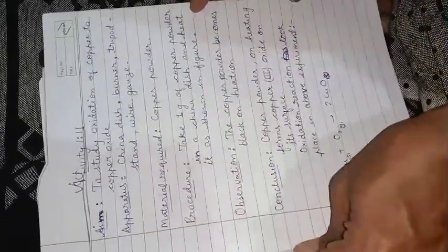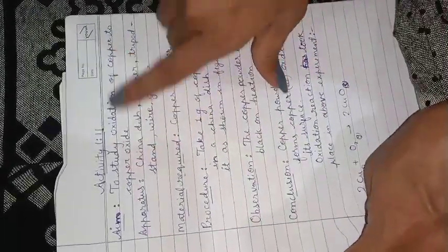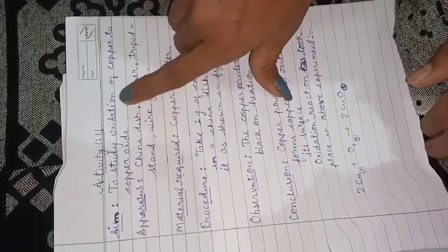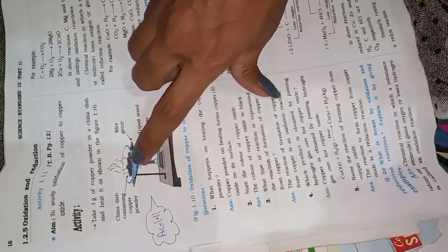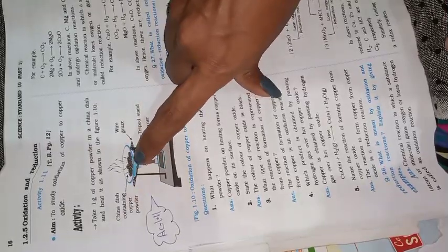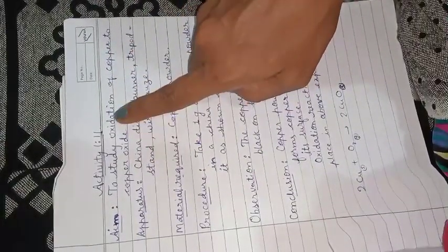So this is a very simple activity. We will study the oxidation reaction through this activity, to study the oxidation of copper to copper oxide. You can see in this figure, in the china dish we have taken copper powder. This copper powder is burnt with the help of tripod stand, burner, and wire gauze. It is taken in the china dish, then the copper powder will be burnt and at the end the color of the copper powder will become black. So our aim is to study the oxidation of copper to copper oxide.